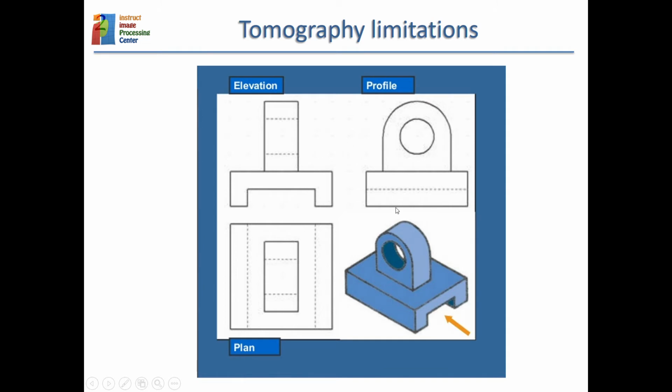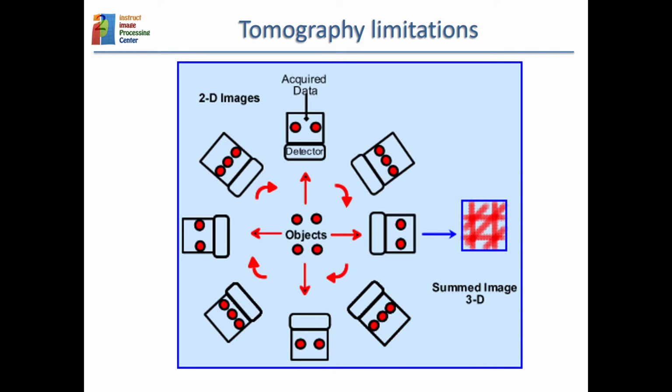So we are all used to this problem from high school, where you were given 3 projections, and from these 3 projections you were able to reconstruct an object. Why is it that we cannot do it now with macromolecules? Because at high school, with only 3, we could reconstruct a full object. And the trick was that in high school we were making a lot of assumptions about the kind of objects that we were reconstructing. And let's see here some of these.